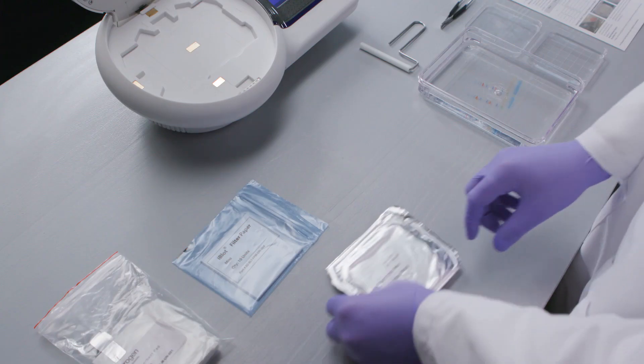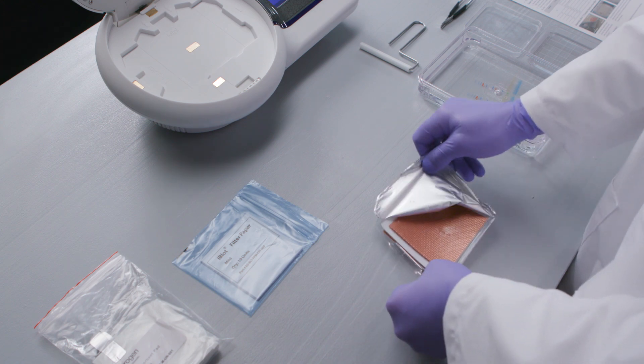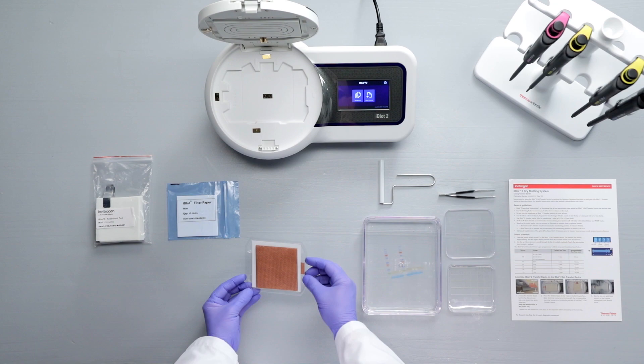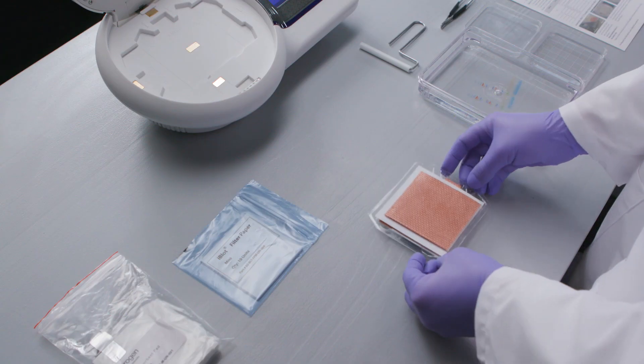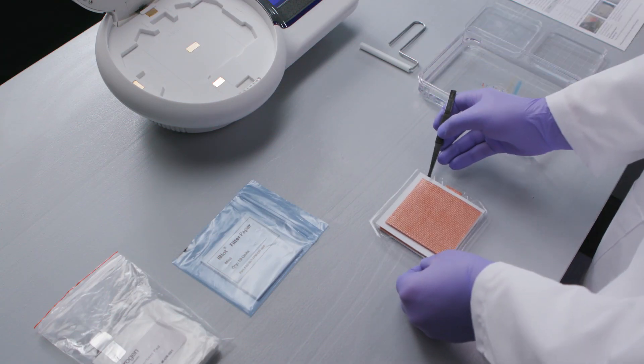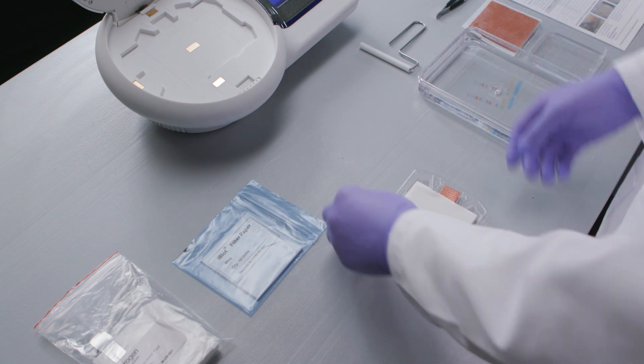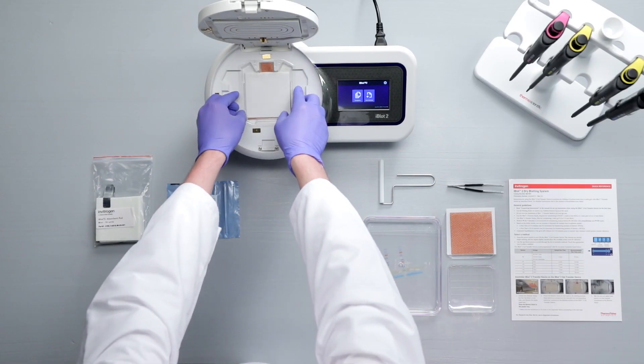Next, unseal the transfer stack. Notice that the top and bottom stacks are in the same tray. Separate the top stack and set it aside. Keep the bottom stack in the plastic tray. The bottom stack contains your PVDF or nitrocellulose membrane.